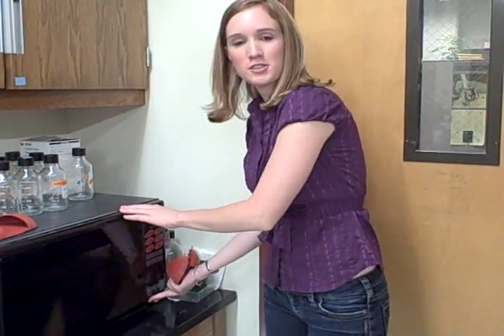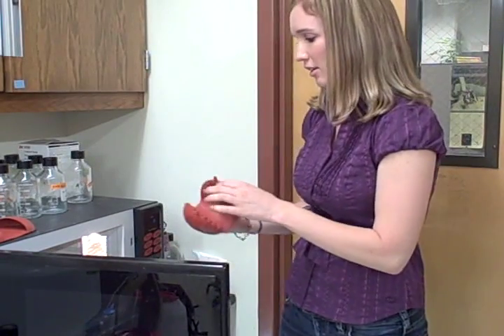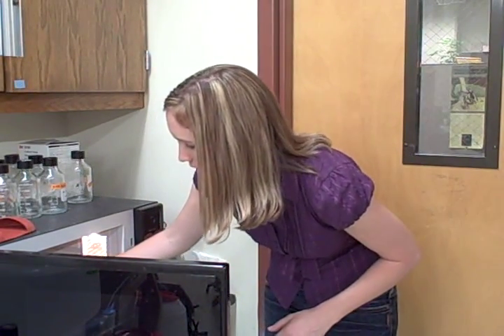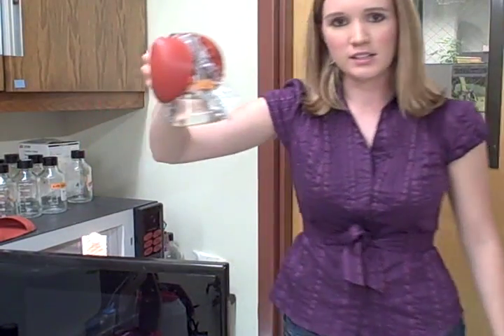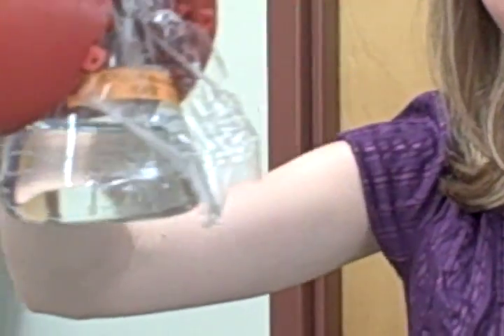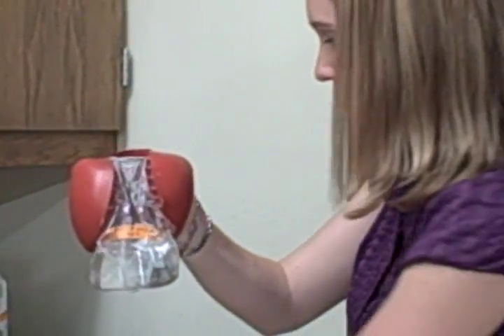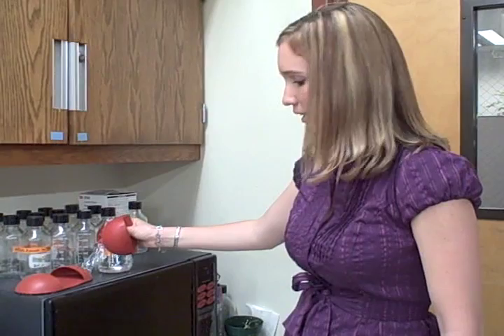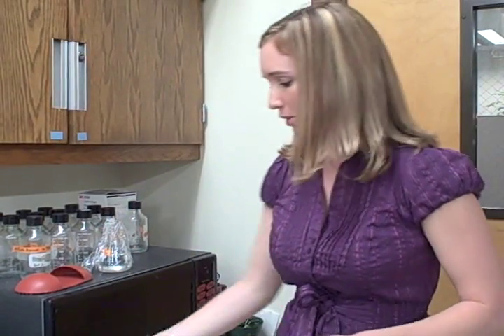I'm going to take the Agarose solution out of the microwave. It's been a full minute and a half now, so it should be completely melted. And as you can see, everything is dissolved in there. So the solution can either be poured into a gel as it is right now, or if you want to let it sit for about 20 minutes, it will solidify and look like this.